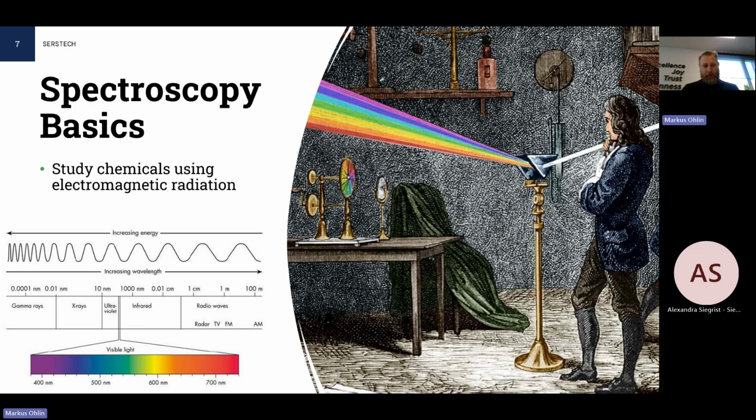And there is, of course, a spectrum, a gradient from very long wavelengths to very short. And we are towards the end in the visible range, you could say, meaning our laser is invisible to most people, although you can see the spot where it ends up.